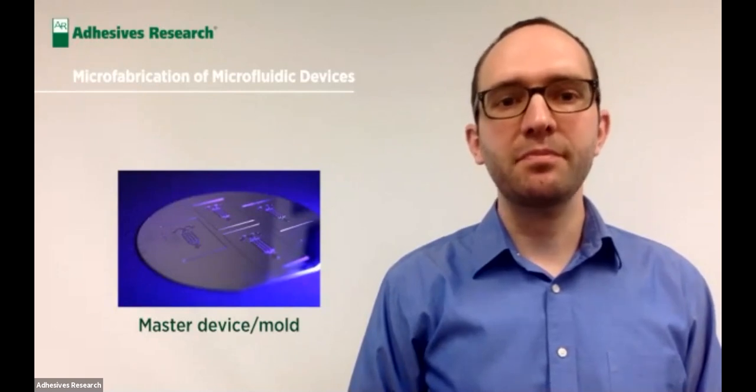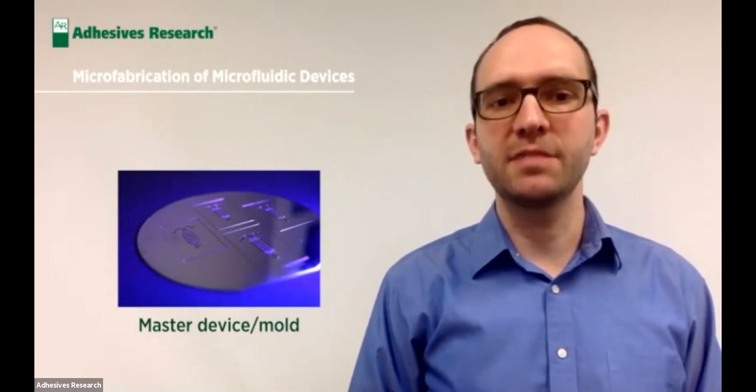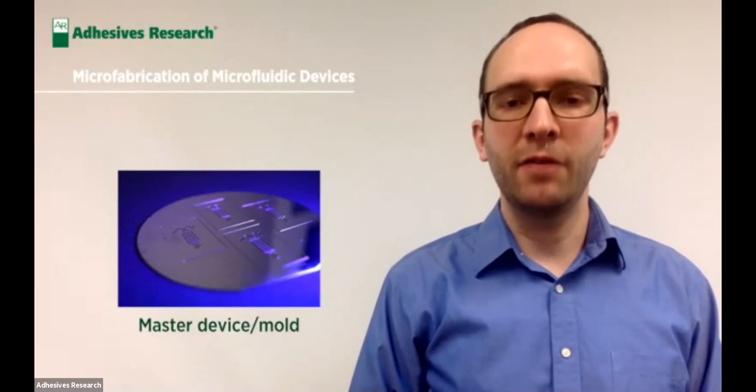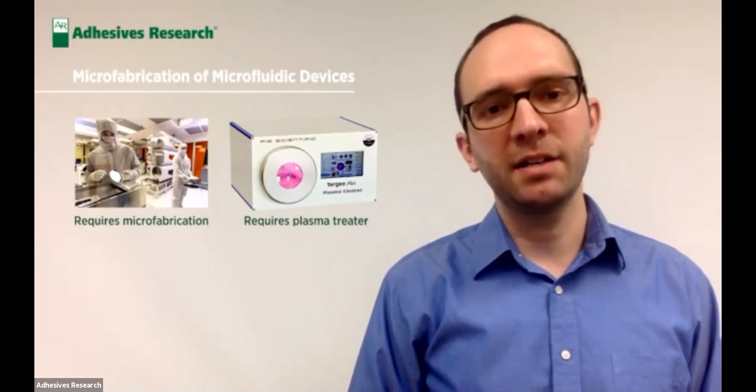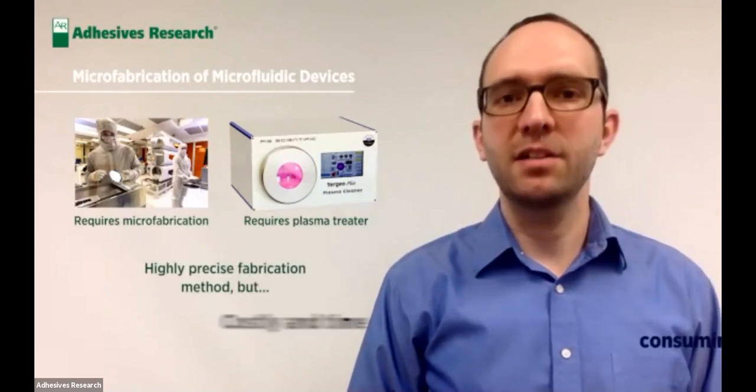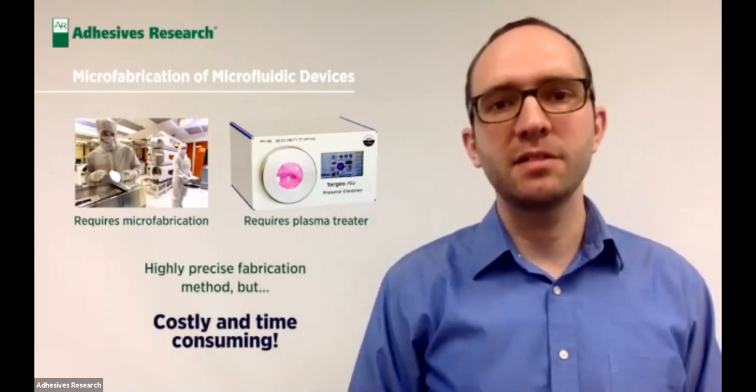and then applying it to a glass slide surface after plasma treatment. And this is a highly precise fabrication method. However, it requires this microfabrication facility, which is expensive to access or expensive to build, and requires that plasma treatment in order to get good bonding. And altogether, it's a costly and time-consuming process.